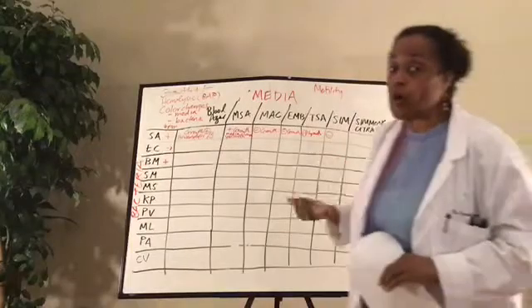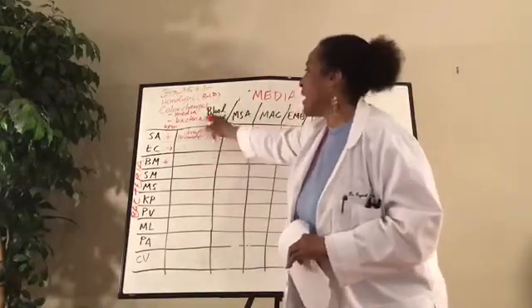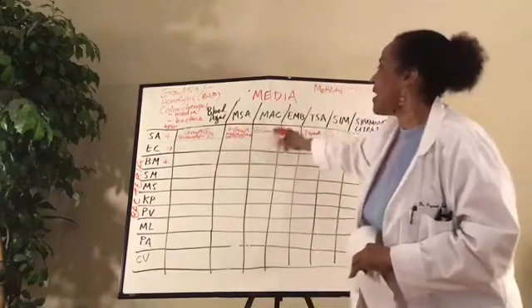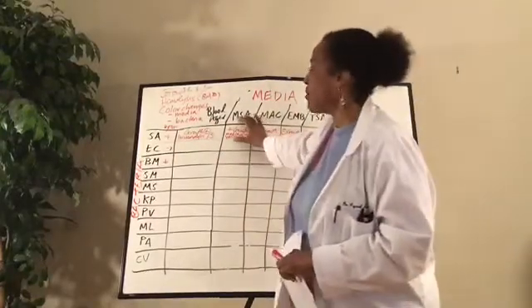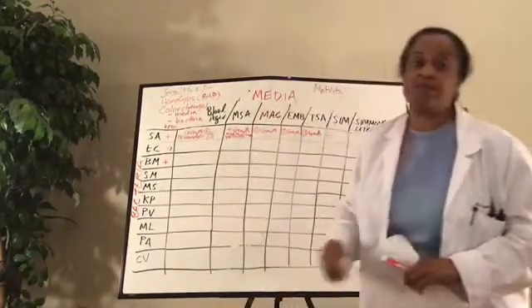Was there any growth there on top of that slant? You'll go through each of those, and like for E. coli, you look at blood agar, you look at MSA, MAC, then you'll do BM, look at it in each one, and then write down something. Make sure that your space is much larger than this one, because I just did it for space's sake.